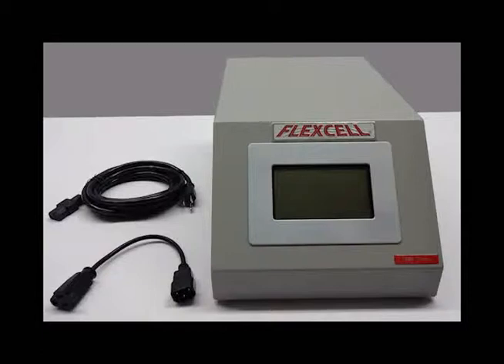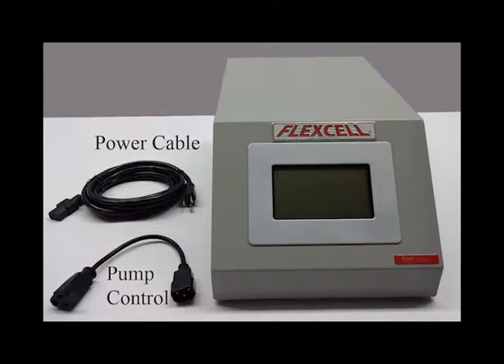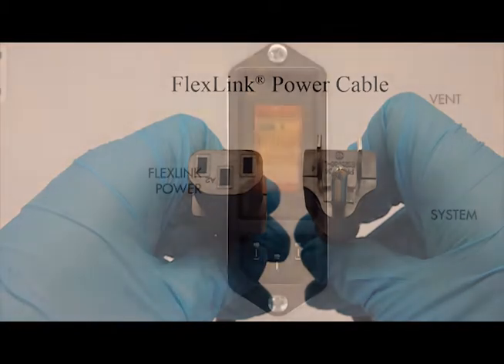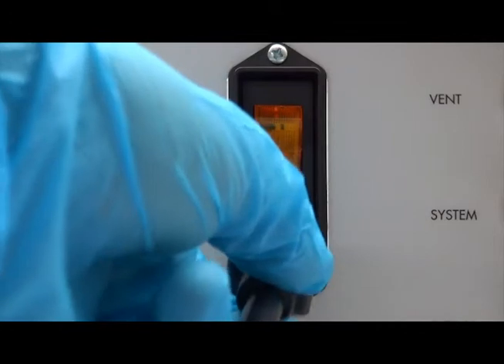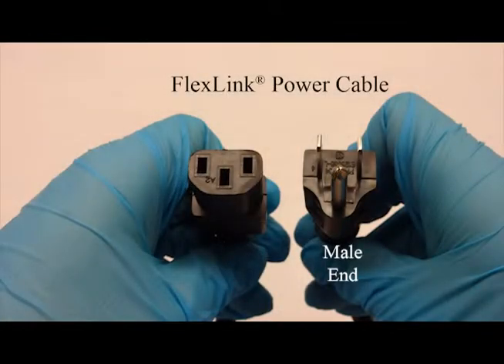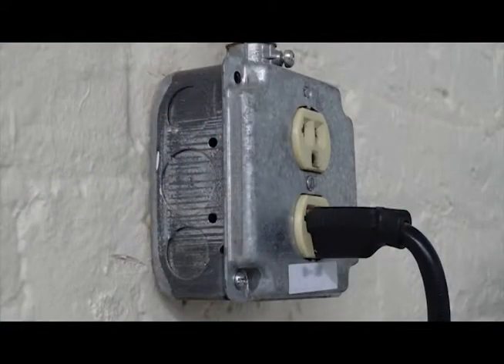This video shows how to connect your power and pump control cables to your FlexLink box. To connect the provided power cable, connect the female end to the FlexLink power outlet on the back of the FlexLink controller. It is recommended that the male end of the power cable be connected directly to the main supply.